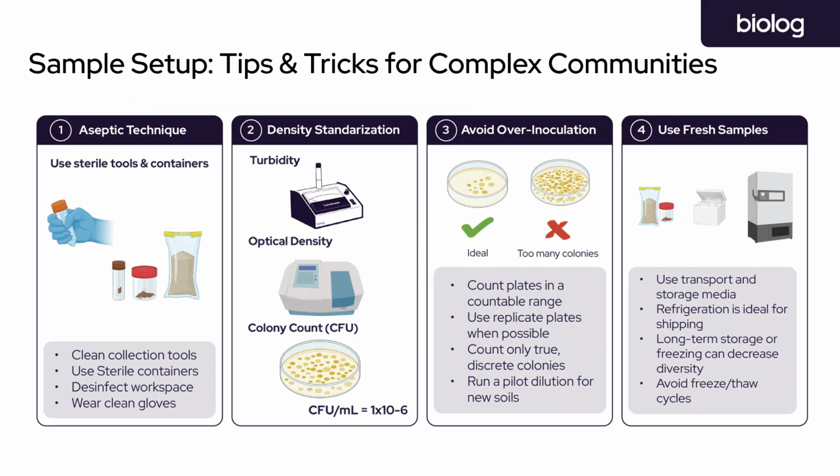Now here are 4 considerations you must always take to maximize reproducibility. So if I was to give you 4 pieces of advice on how to set up EcoPlates, these would be it. So first, always ensure you're using aseptic techniques, right? Clean collection tools, sterile containers, clean workspaces, use gloves to protect your sample from contamination, to avoid cross-contamination, right?